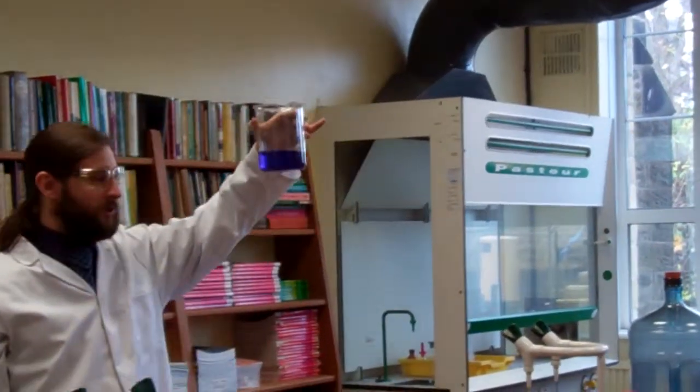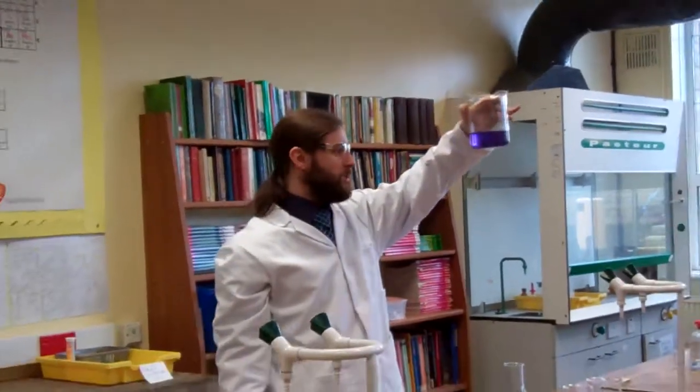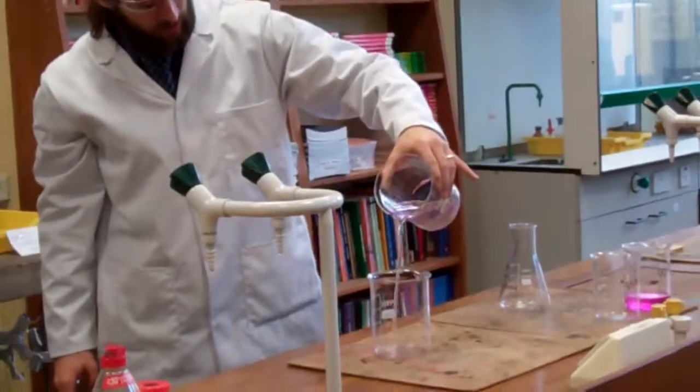And then we add it to the other beaker again, and we can just keep doing this all day long, changing its pH backwards and forwards. But as we watch, it slowly loses its colour. Nice pink, and back to clear. And then we can send it clear again.